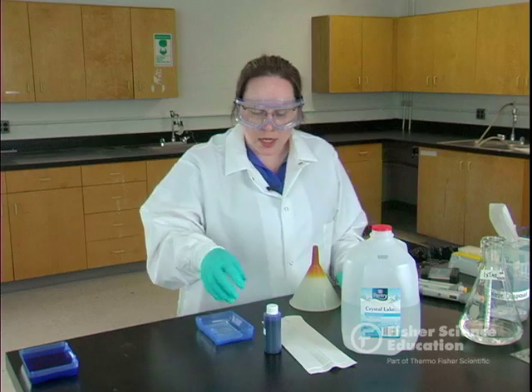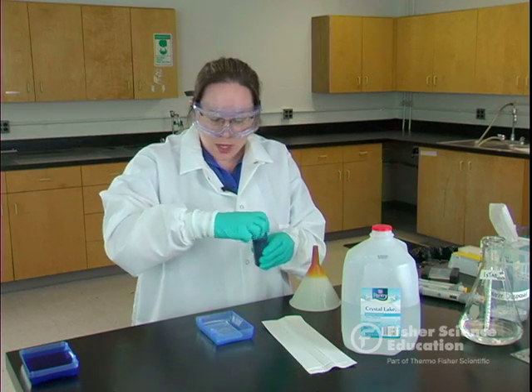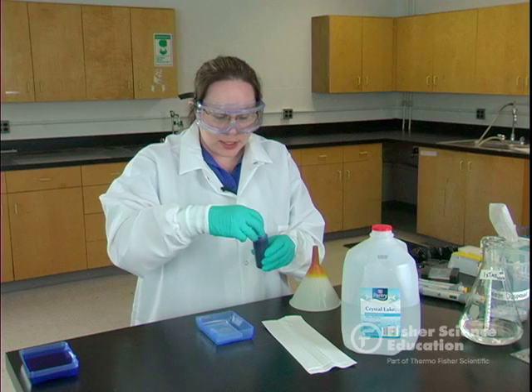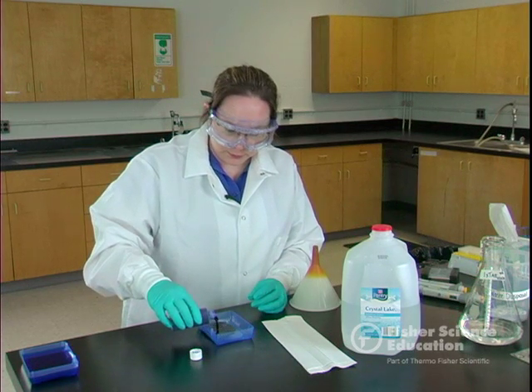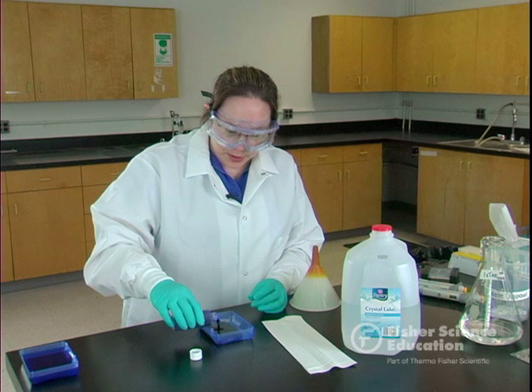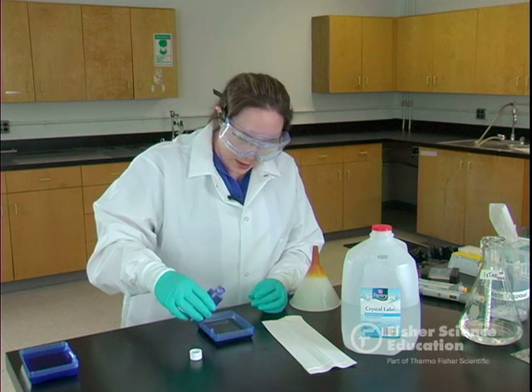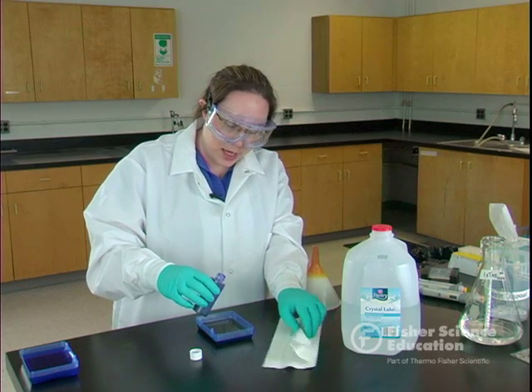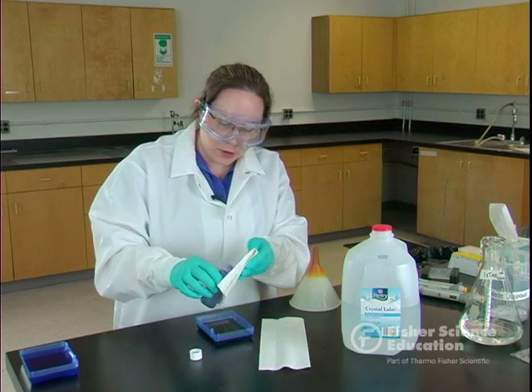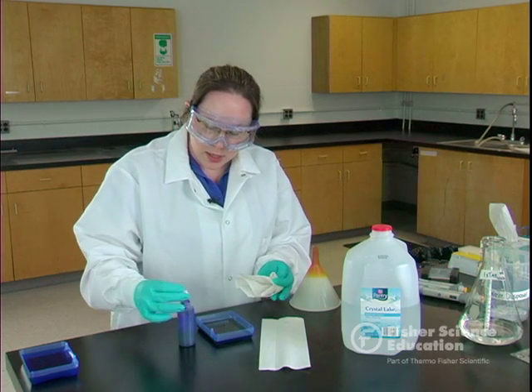This is a fast stain called Flash Blue. It's very concentrated — actually 10x concentrated. We're going to go ahead and pour this in, and you want to make sure that it completely covers the gel. Fill it up until it's covered. I always like to keep some paper towels handy to catch any drips before they hit the lab bench.